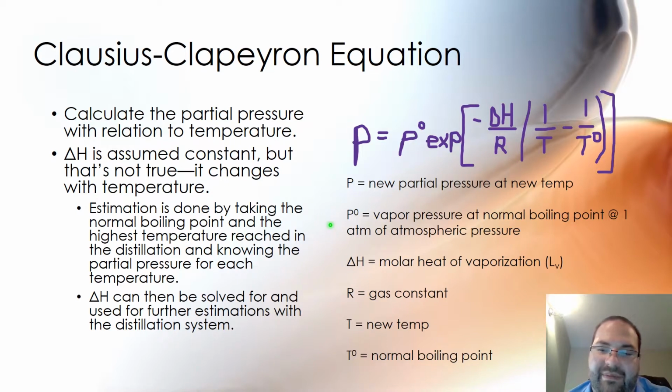okay for the purpose of working with some calculations to determine whether or not you can predict a fractional distillation curve. And I'll show you what I'm talking about in a moment.